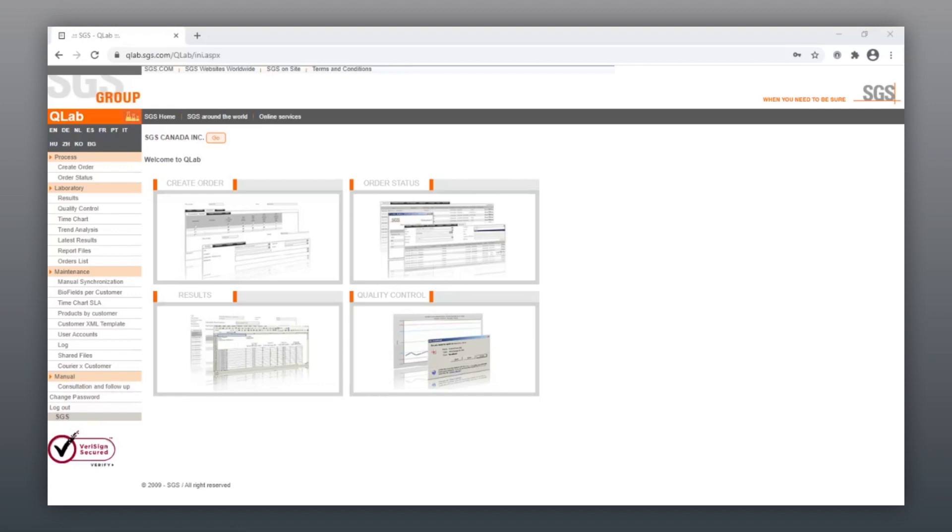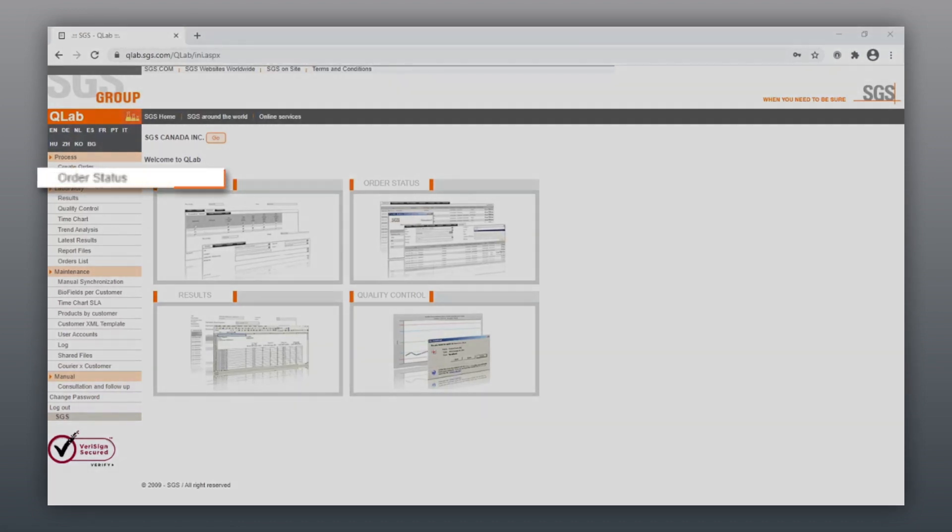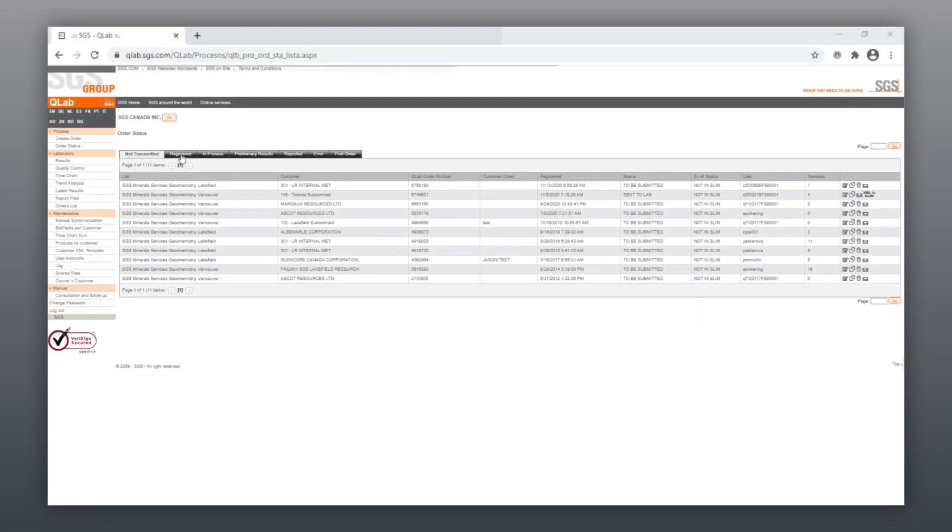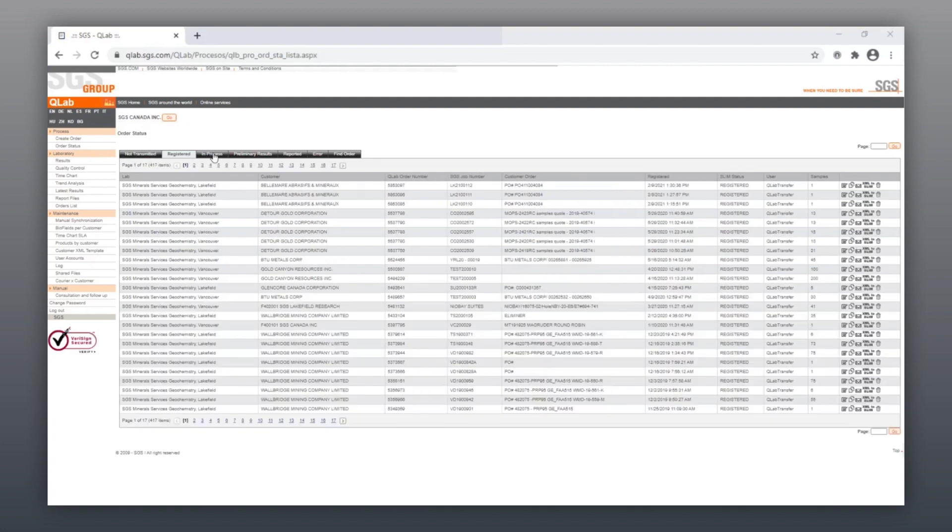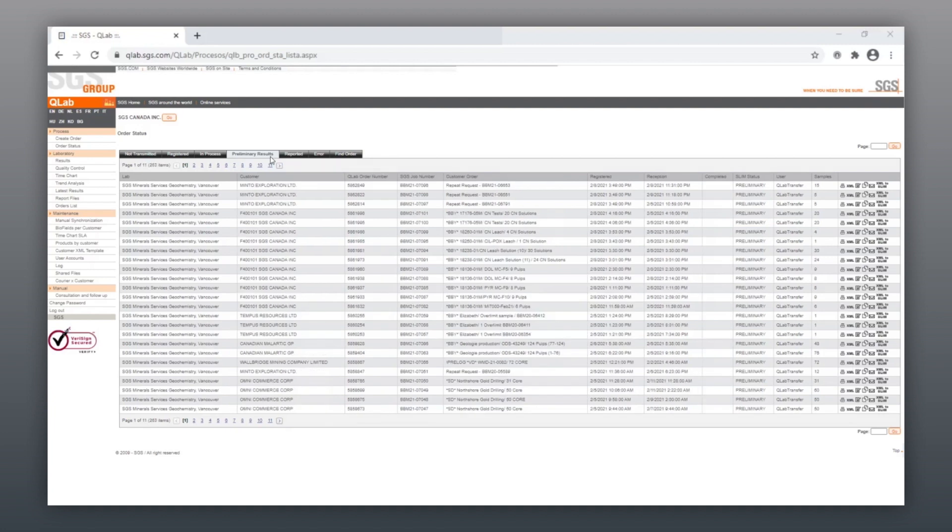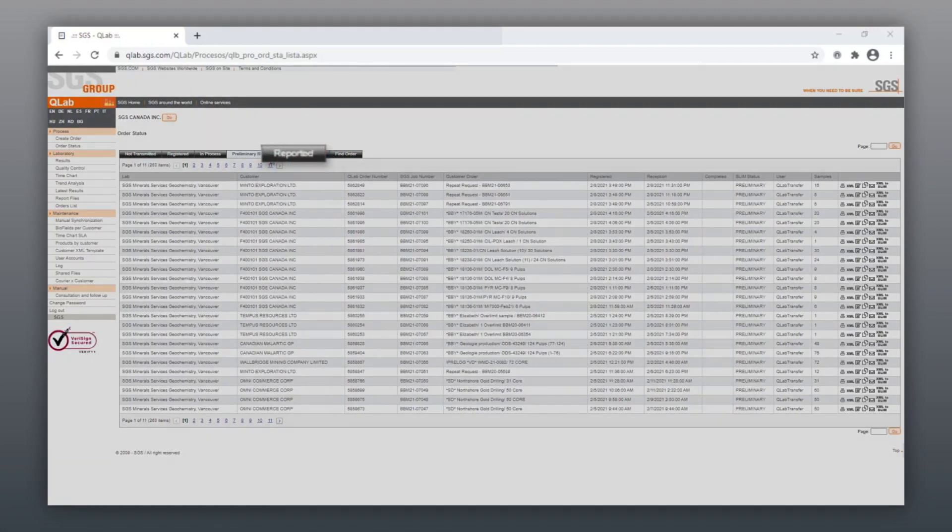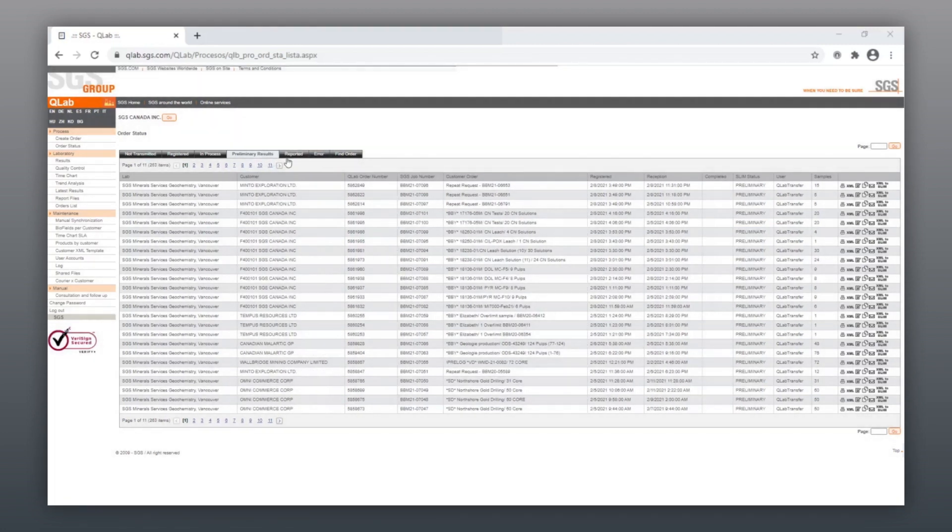To see your order status, click on the Order Status on the left-hand side menu. On the Order Status page, you can click on the tabs along the top of the page to track the status of your order. When the data is finalized, your order will appear under the Reported tab.